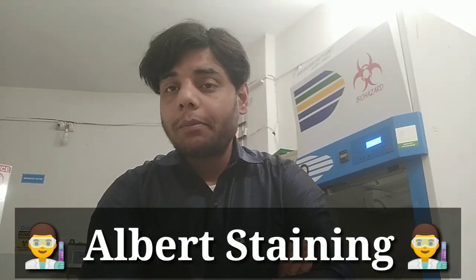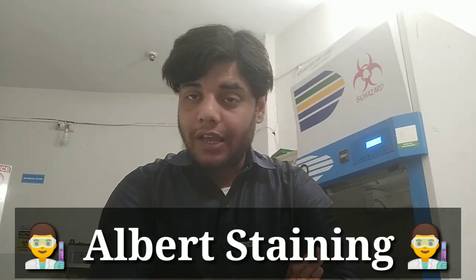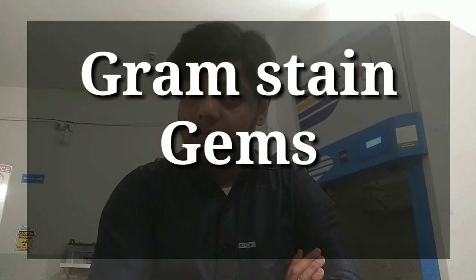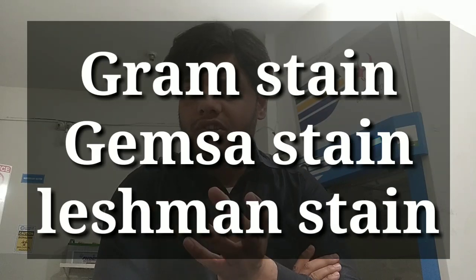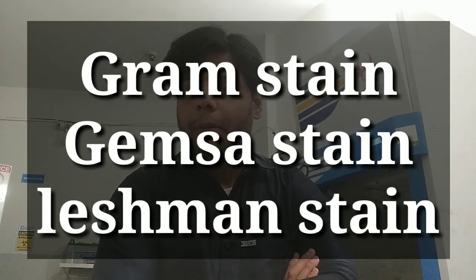Today I'm going to explain another lecture related to staining techniques, and it is about the Albert staining. If you remember, we already talked about different stainings, like Gram stain, Giemsa stain, and Leishman stain. If you want to watch all these staining techniques, there is a playlist on my YouTube channel named staining. When you click on it, you will find all the staining techniques. Today I'm going to explain Albert staining.